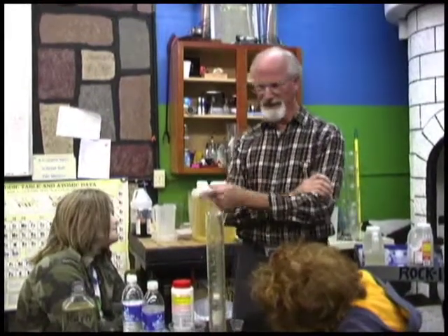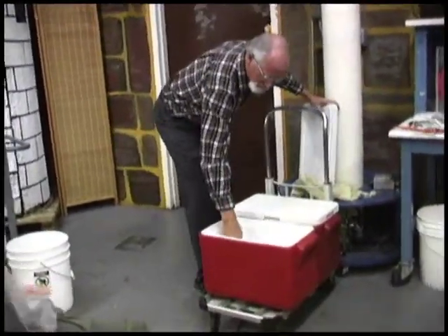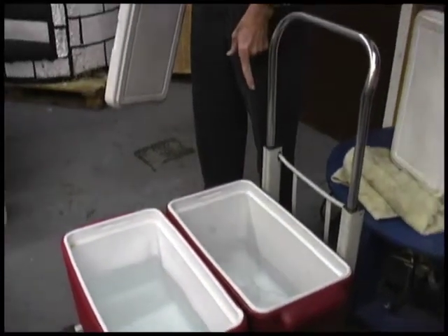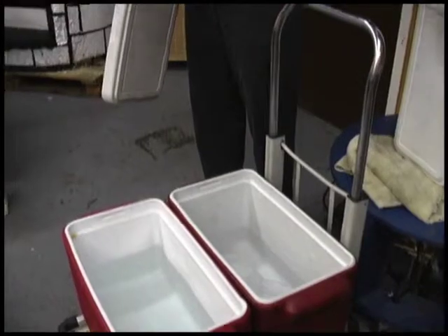You're going to take one bottle and put it in this ice chest, which is full of hot water, and one bottle and put it in that ice chest, which is full of ice. And then, when you get bored of them sitting there, you're going to take them out, shake them both, set them on the table, and see what they do.